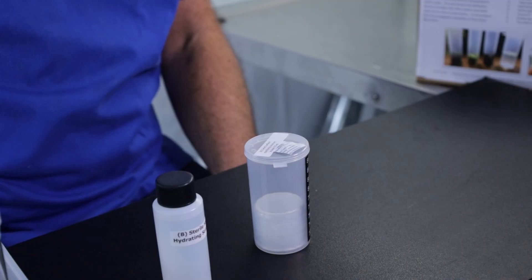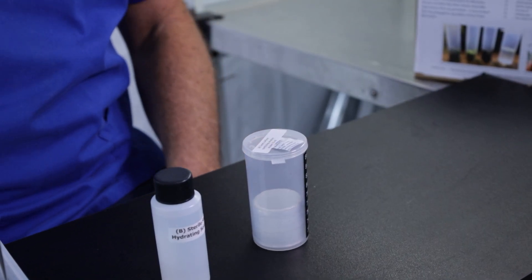The hydrating solution is going to sit on the seeds overnight, as long as 48 hours if you need, until the seeds sink. When the seeds have sunk in this solution, they are ready to be transplanted into the coir tubes.